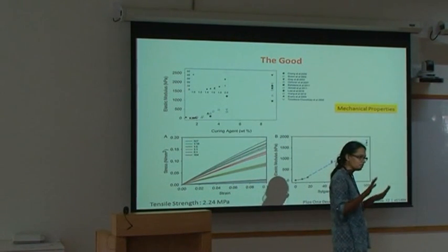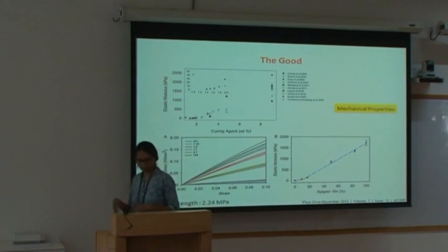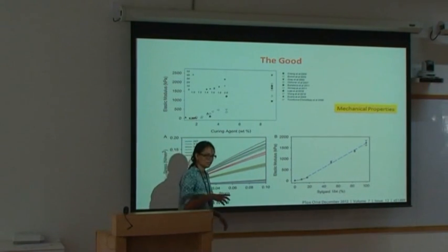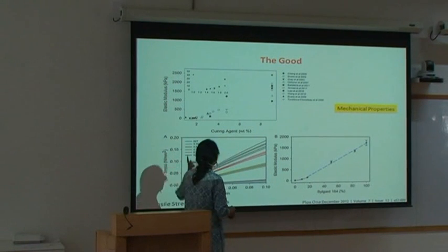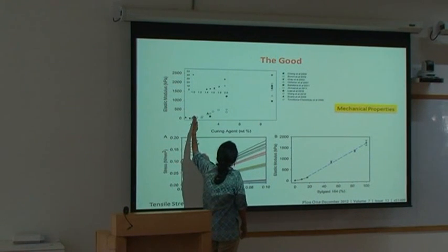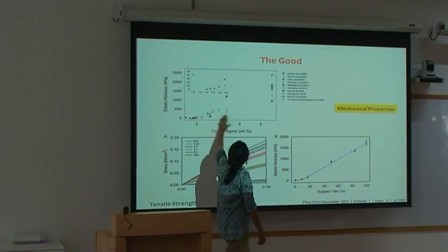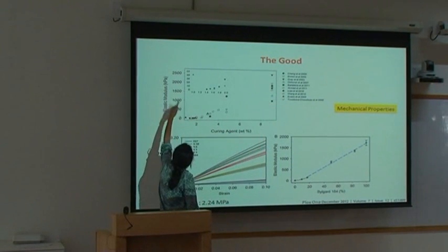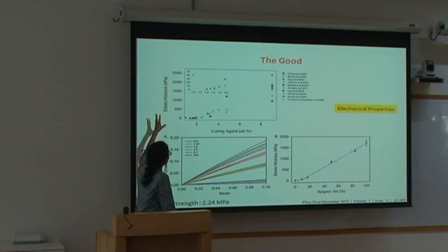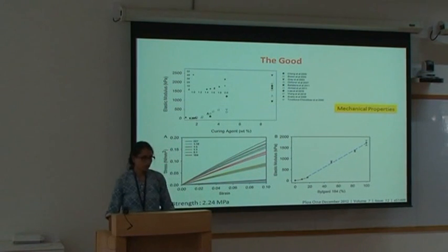When you work with different kinds of cells, which like different kinds of matrix rigidity, that's where it becomes more important, and that's why it's up there. Different ways of doing it include the cross-linker that I mentioned. How much of the cross-linker you use can change it. You can go from 2 weight% to this. Yesterday we used something like here, and by just changing that, you can go almost 1 order of magnitude in the stiffness. And if that's not good enough, then you do that, and you can also play around with that.